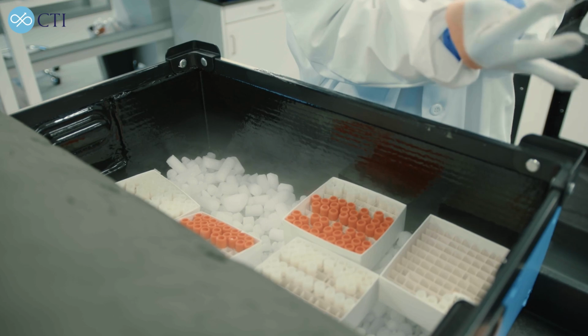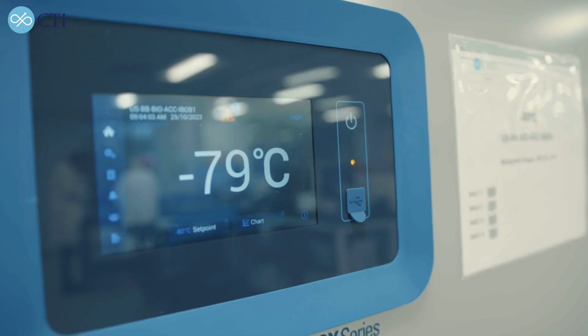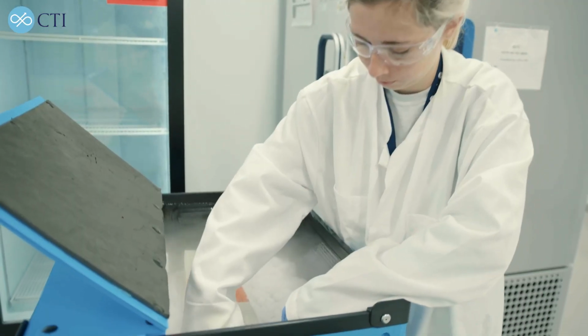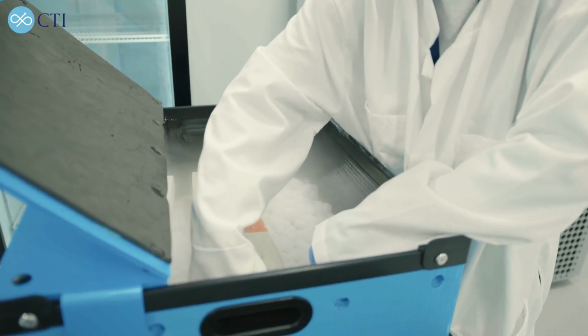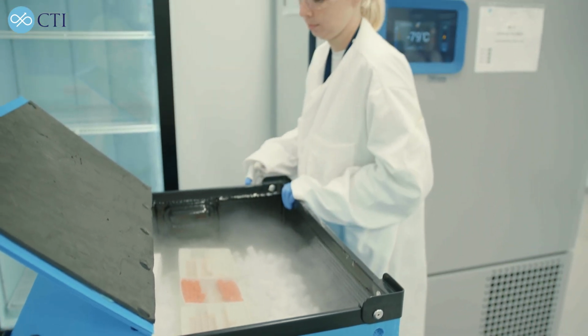Now, I mentioned short and long-term storage. There's a difference there. Long-term storage can be at the end of a study for 5, 10, 15 years past the close of the study. Our clients will want us to hold on to samples so we can recover them later. Short-term storage, maybe samples are being sent out to another specialty lab for testing, or maybe the client wants us to hold samples and test at a certain batch frequency. So they will go into short-term storage.